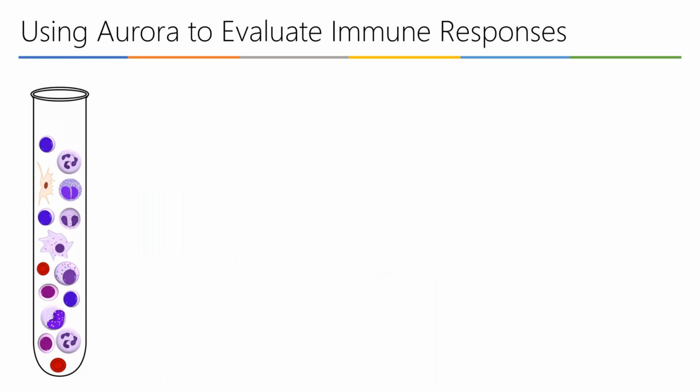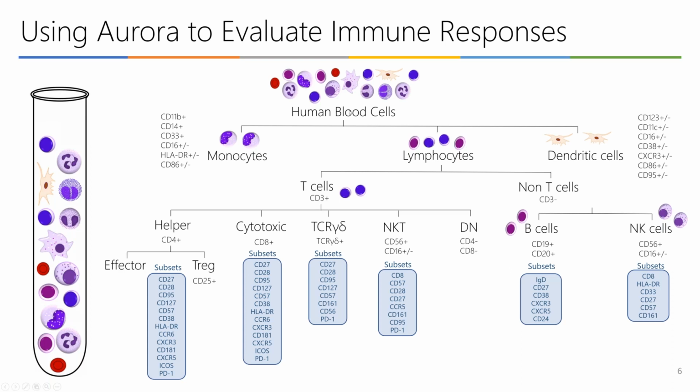This technology can be used for multiple applications, including immunological studies. And now that we can build larger panels, we can expand the immunophenotyping and the understanding of the complexity of immune response. This particular panel explores human hematopoietic cells.